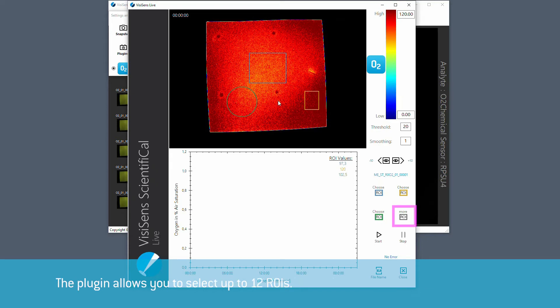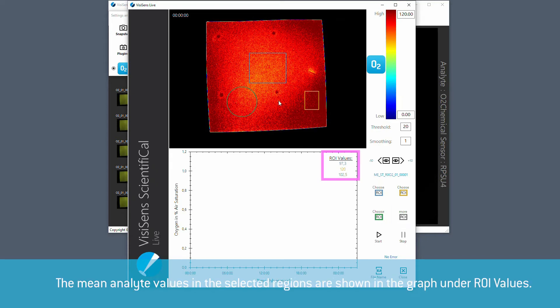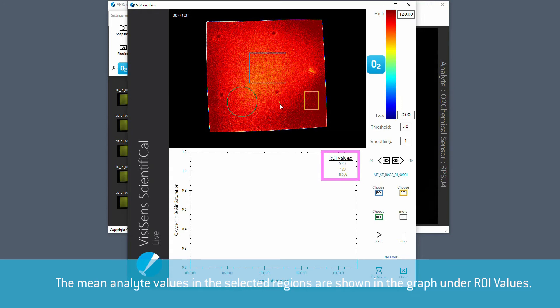The plugin allows selecting up to 12 ROIs. The mean analyte values in the selected region will be shown in the graph under ROI values.